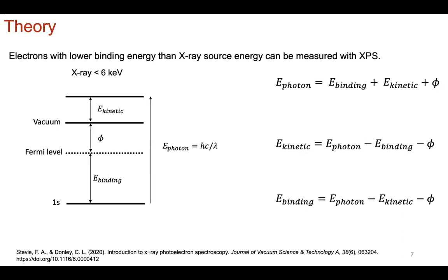So there are databases. Usually if you go into the XPS room, there's a folder that is this thick, and it's literally every single element. That's been worked out already. So is that just like you're telling the detector that work function?